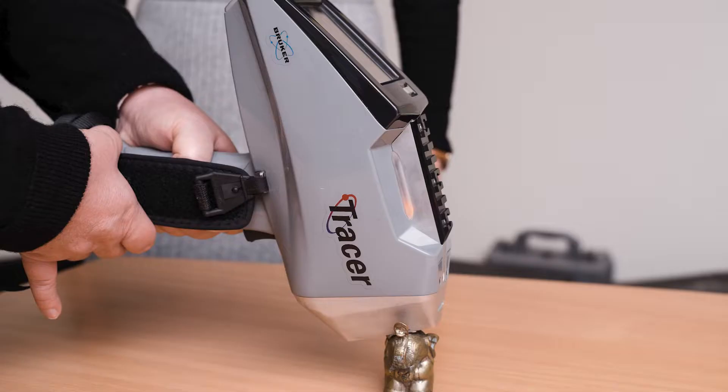That's by the Bruker Tracer 5. The majority of portable XRF instruments can only detect down to magnesium.